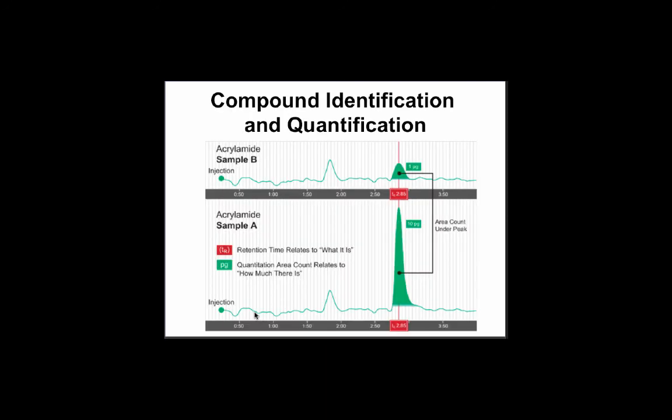The other thing that's nice about chromatography, liquid or gas, is that the detector is sensitive, so you can not only identify by where they come off, but you can identify how much is coming off by looking at the area under the curve. So you can see the top one has a very small area under the curve. It's coming off at exactly 2.85 minutes. And you can probably estimate the difference in quantity by about a factor of 10. So 1 picogram versus 10 picograms. So this could be both liquid chromatography or gas chromatography, but because gas chromatography is so much better in terms of retention index and normalization, and because it's so much better in terms of resolution, it's generally easier to quantify compounds through GCMS.